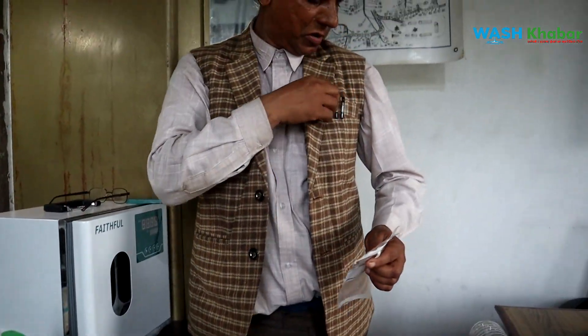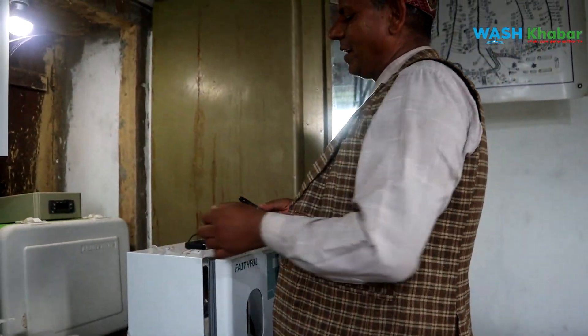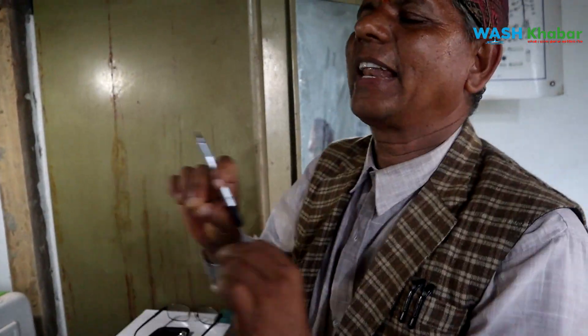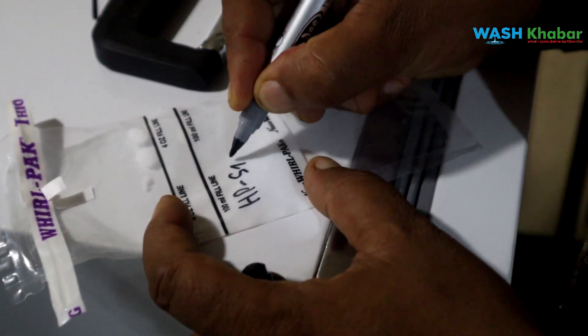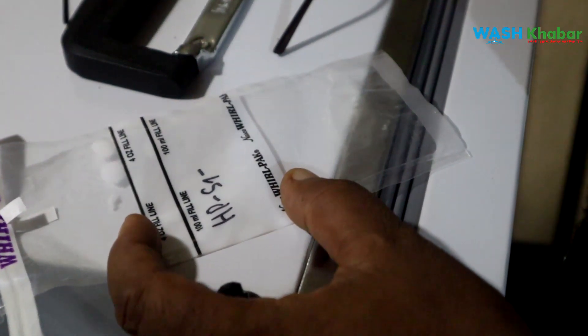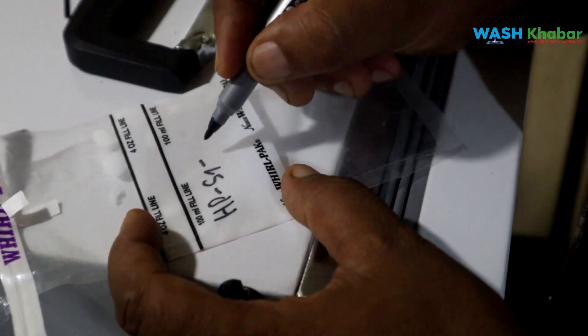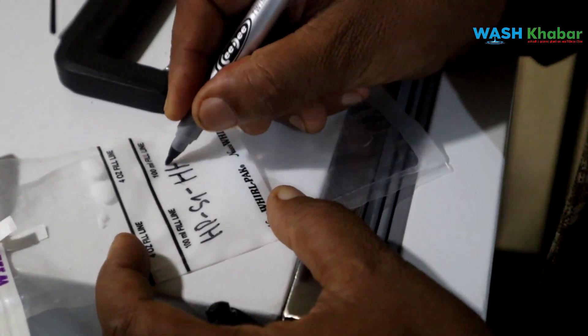I would like to use this sampling bag. The first to use the same sampling bags. This is sample ID. I would like to use the S.P. I would like to use the other sampling. What kind are you going to go to? That is the householder. How much is there?